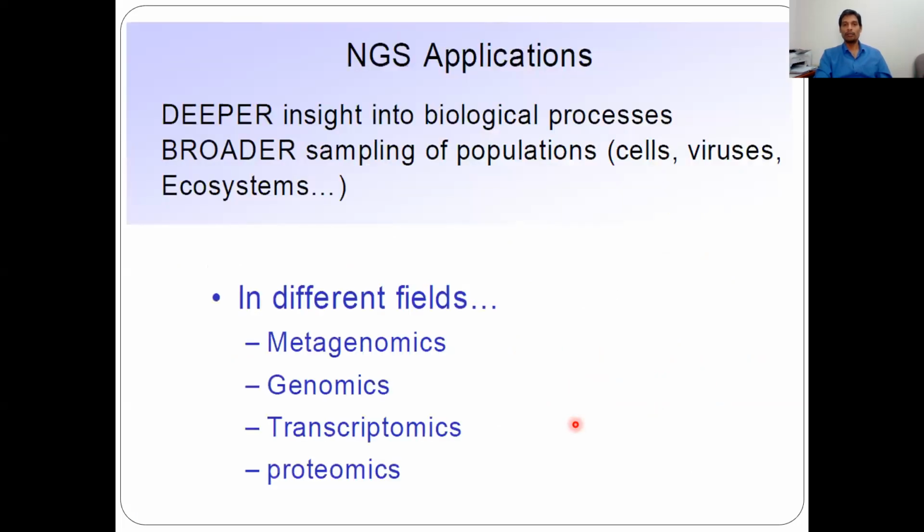When I started teaching this, nowhere could I find this information, not in any of the textbooks, not even in videos. So I took it from that slide, and I went to those workshops, got the information and started teaching. And yeah, the applications of NGS also include metagenomics, genomics, transcriptomics, proteomics.